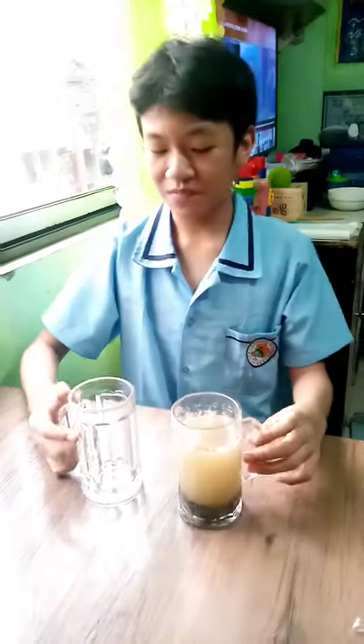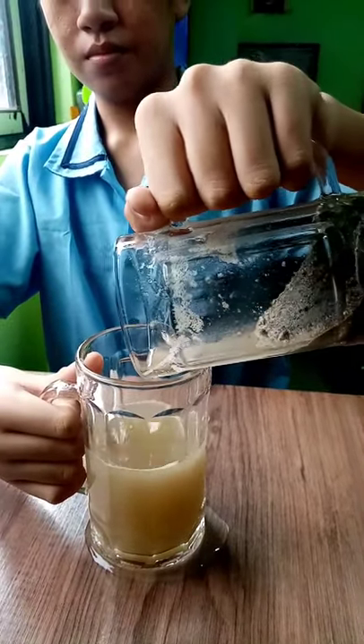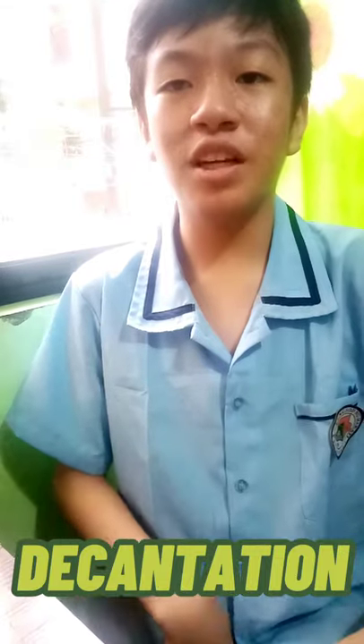After that, let's take the other glass. Then, we pour it in. We have now successfully separated the sand and the water. Decantation is a process of separating mixtures by removing a layer of liquid when a precipitate has settled.